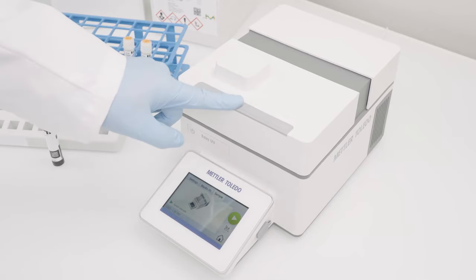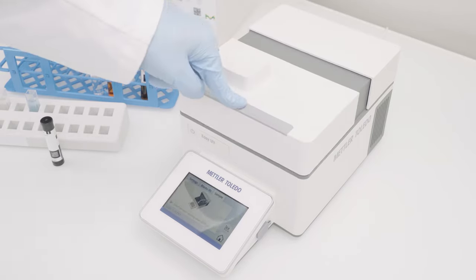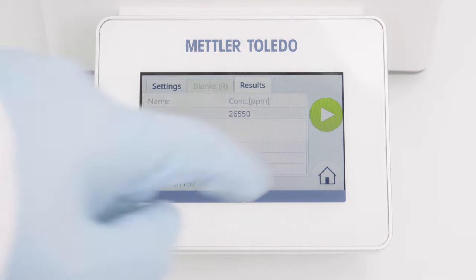By clicking on Sample, I am requested to insert the sample. I am inserting the sample cell, close the lid, and the measurement starts automatically. To measure additional samples with the same settings, simply click on the Start button again. I am now directly asked to insert the sample.